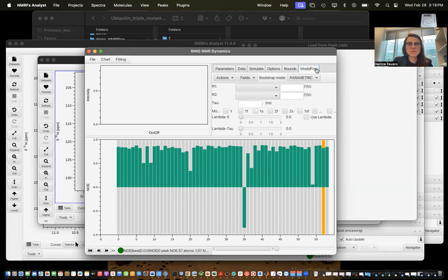Also, one thing is the numbers I got for my T2 are not correct because I didn't convert the VC list to an actual list of delays.